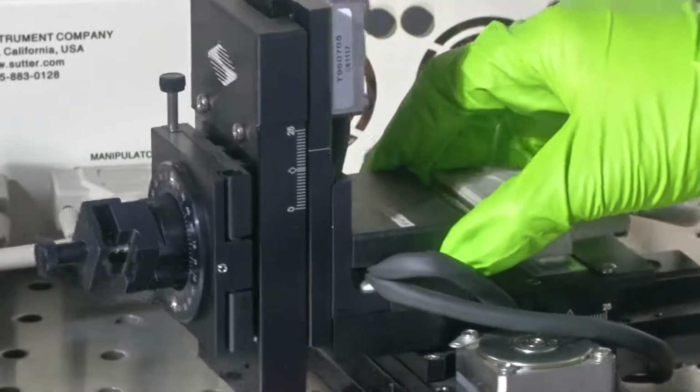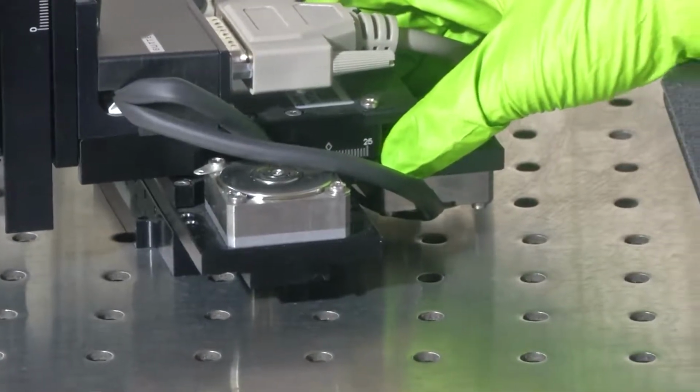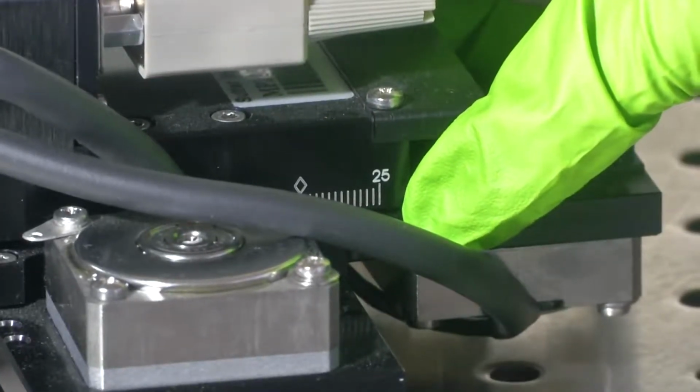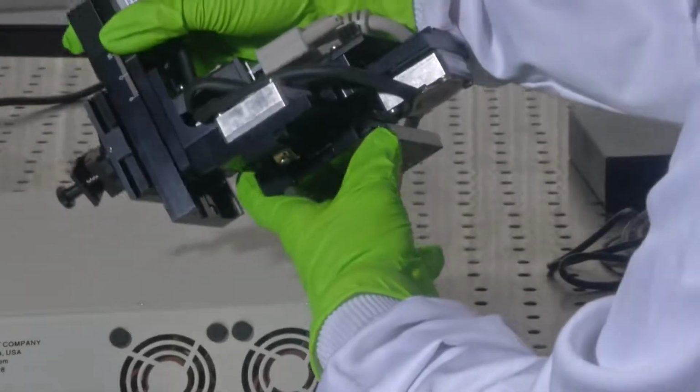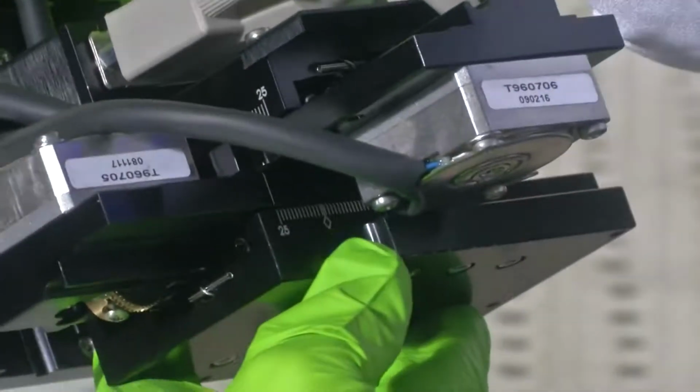and here is the stage for z axis, and then beneath is the x axis stage.